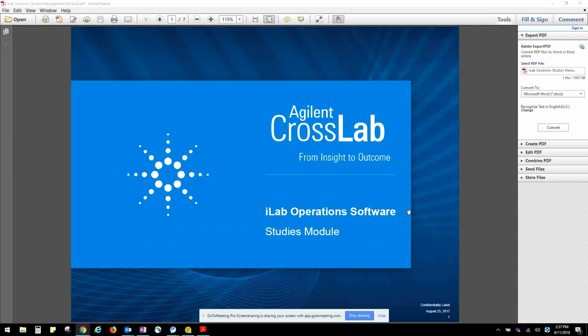All right, perfect. So again, Misty, just to recap what we're doing here, the idea is to give you more of a conceptual overview of each of these modules. As cores indicate interest, we can dig deeper as need be, but I think it's good to give you an overview here.